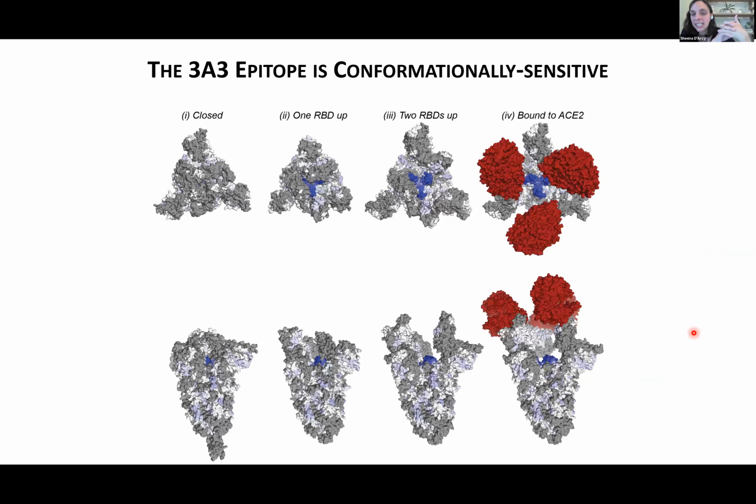Now, what's interesting is if we look at this HDX data in the context of the spike protein in its trimeric form. Here, again, I'm projecting the HDX data, but in gray, I'm showing regions of the protein for which we had no coverage, right? Remember, that was quite a lot because we didn't allow for glycosylations. We can see that in the trimer, when it's in this closed state, so that's when the receptor binding domains are all in the down state, we cannot have access to our epitope.